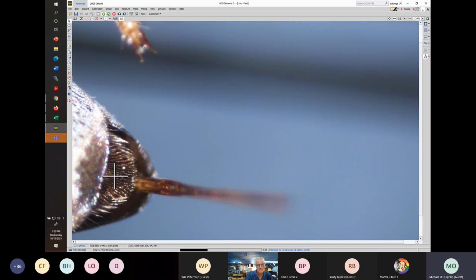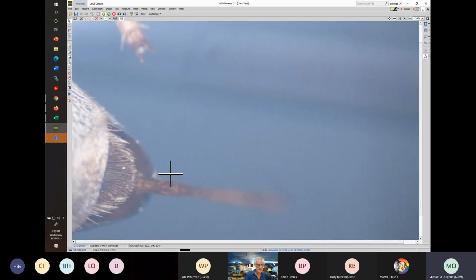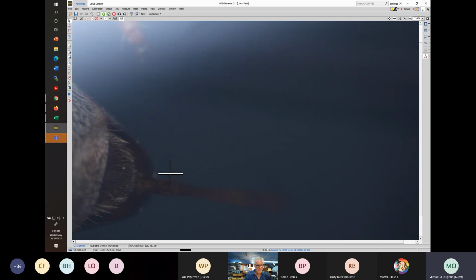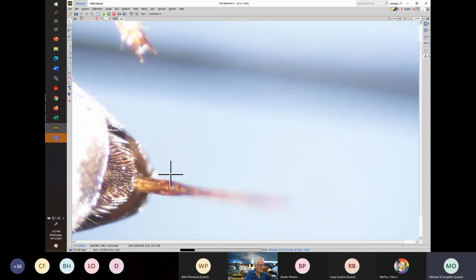Here's the rim of T, I think that should be T6, and here's the rim of S6. And these are much broader. They're overlapping, so you don't see the rounded nature of them. I'm going to fix it a little bit with the paper to see if that helps. It doesn't seem to. Let me try a different angle.